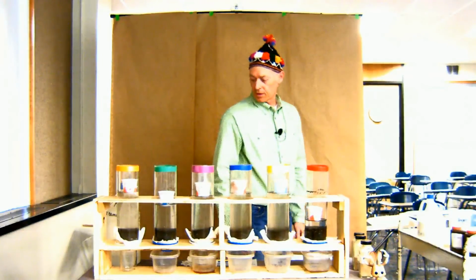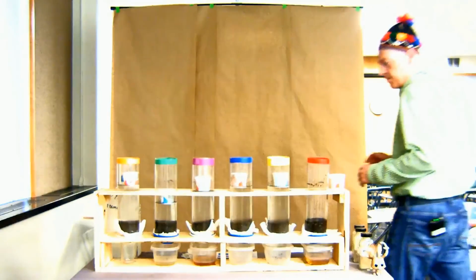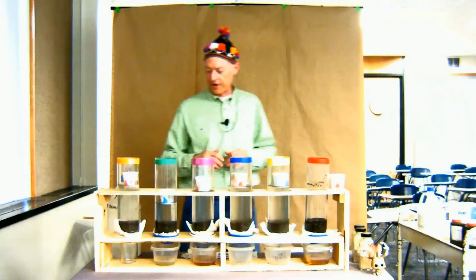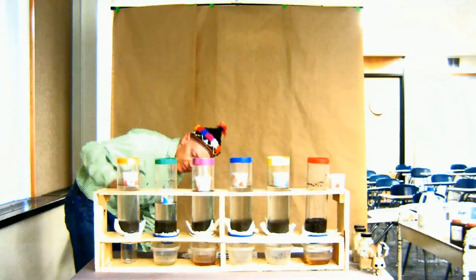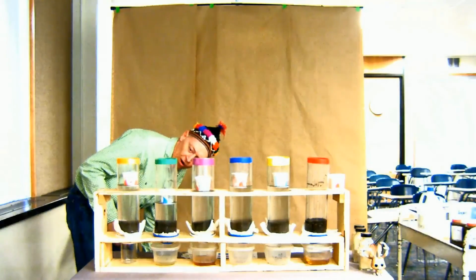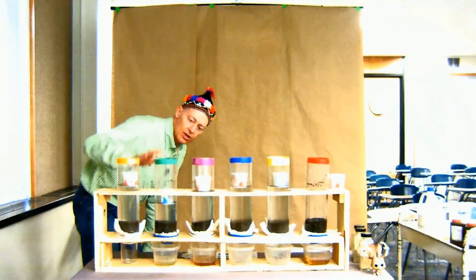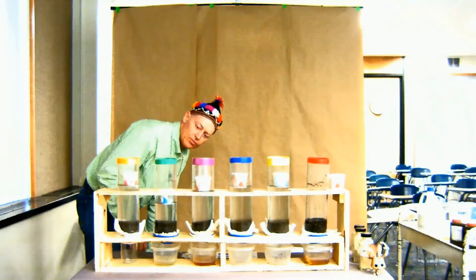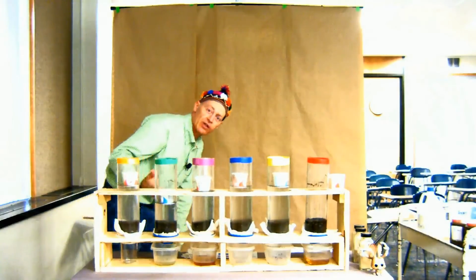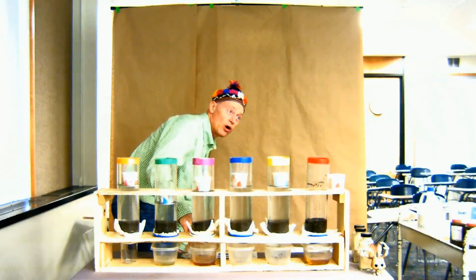So, okay, come back here, take a little gander. So we have in the orange one, this was our sodic soil. We added water. Not a drop of water has come out, nil. In the calcium chloride one, we start to see some water moving through because of the high electrical conductivity, because of the chloride. Here, this is the powder flue gas gypsum. Hey-oh, we're getting some water move through here.